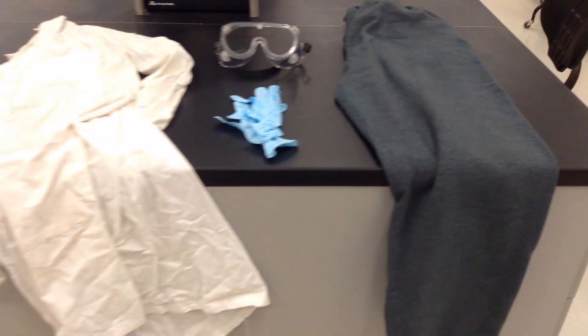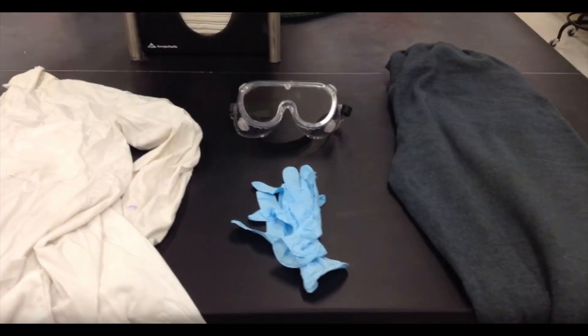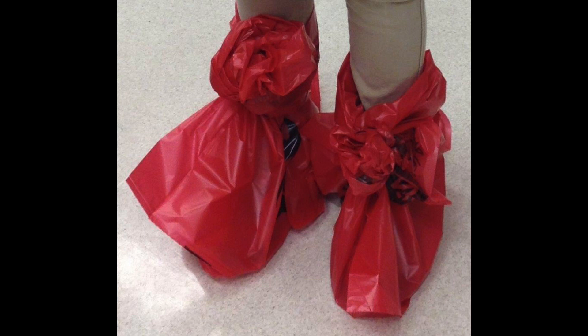The long pants must cover your entire legs and not leave any skin exposed. We will provide gloves for you in lab. Also note that the lab coat will remain in the lab throughout the semester and will not be permitted to be used for other lab coat requiring classes such as chemistry and biochemistry. If you forget to bring in closed toe shoes, you may be asked to wear the following footwear. It's best that you bring in appropriate footwear, that is closed toe shoes.